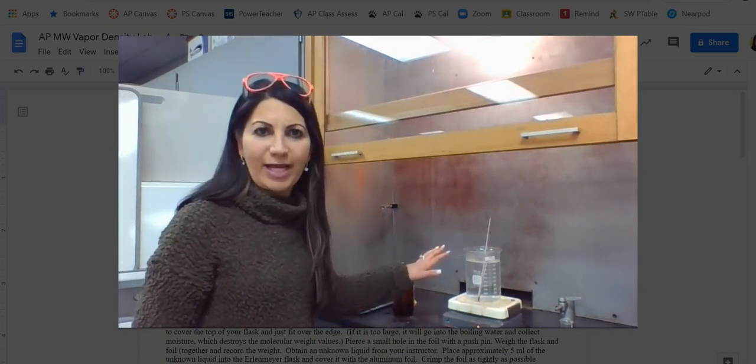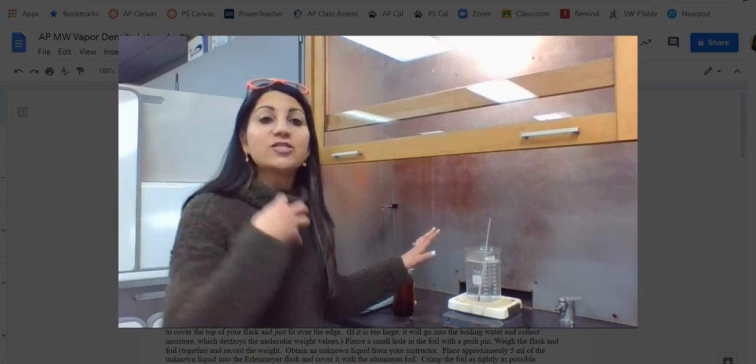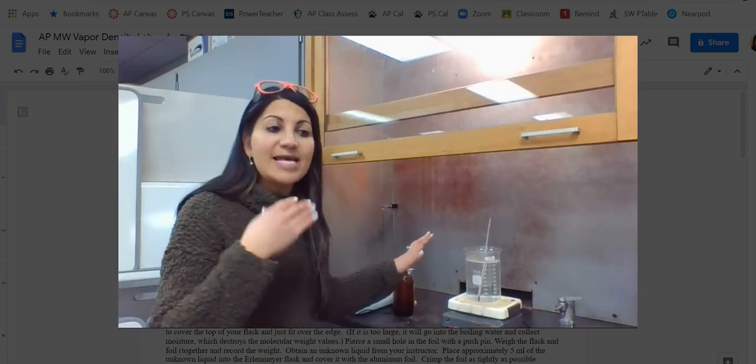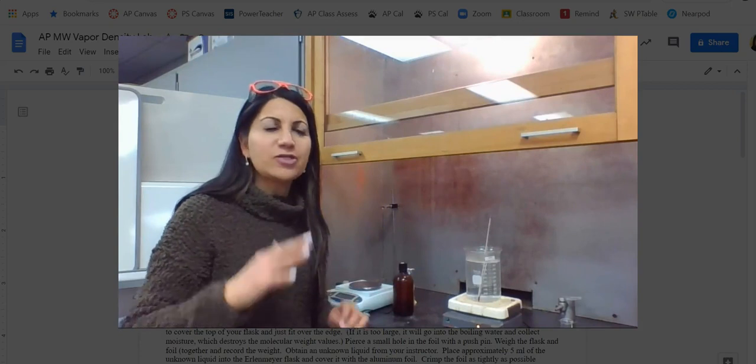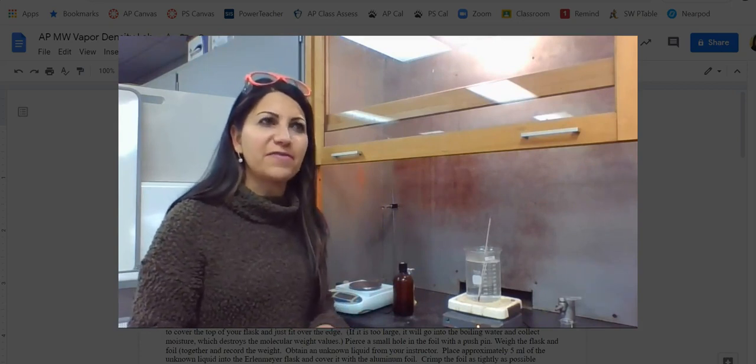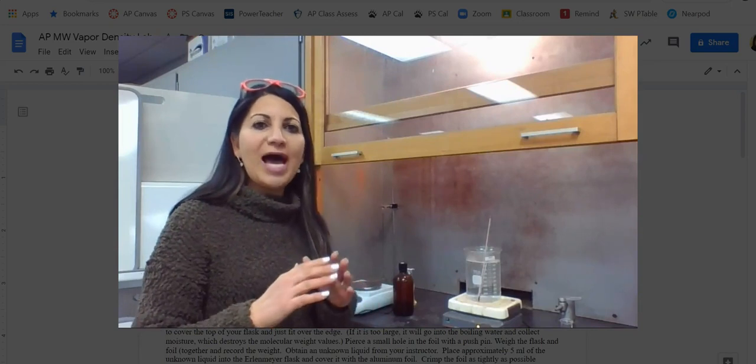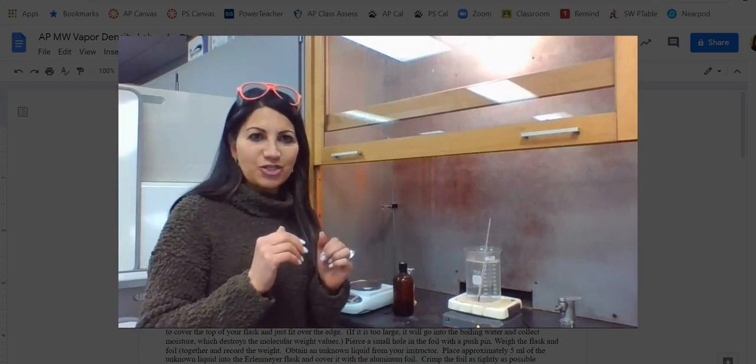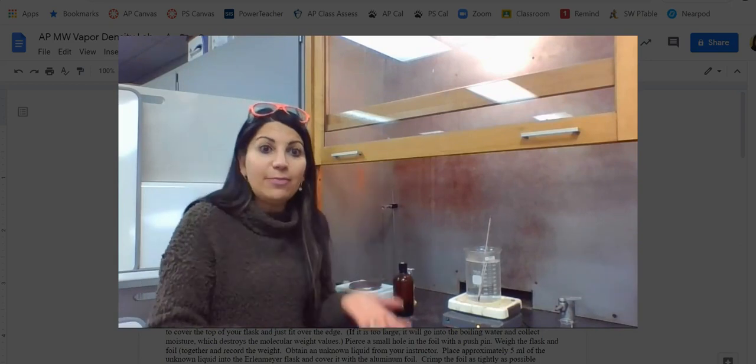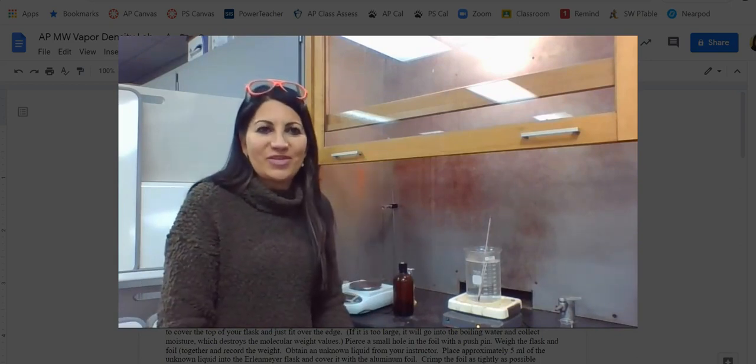I've got boiling water going on right here. Now, since we are in West Bloomfield at a little bit of a higher altitude, we're about 500 feet higher than sea level. Well, remember the higher you go, the lower the atmospheric pressure, and the reason for that is gravity pulls everything down toward the center of the earth.